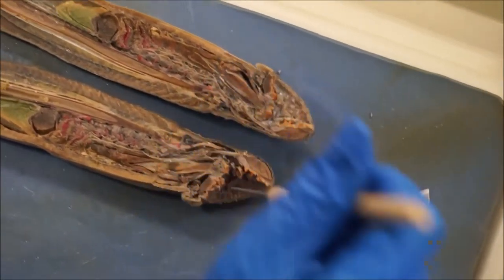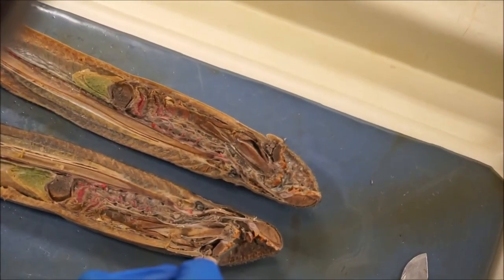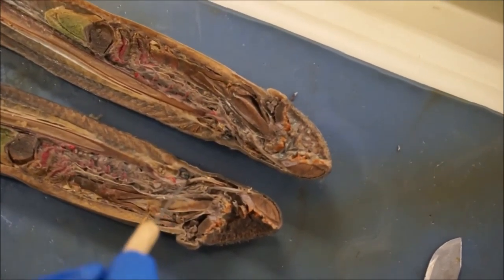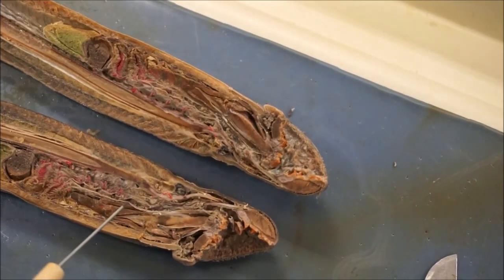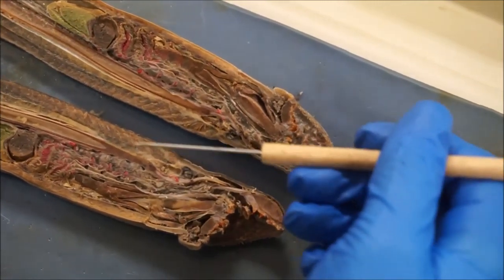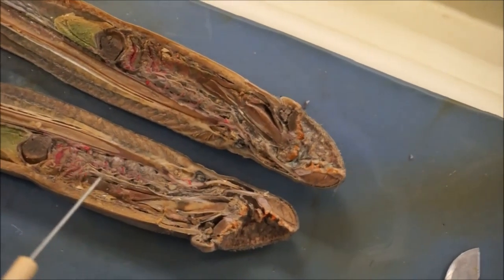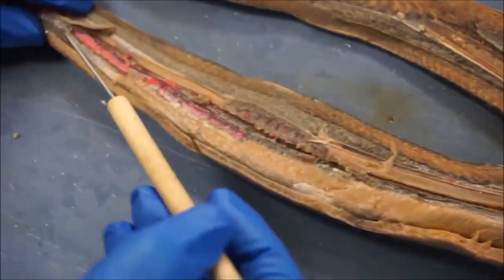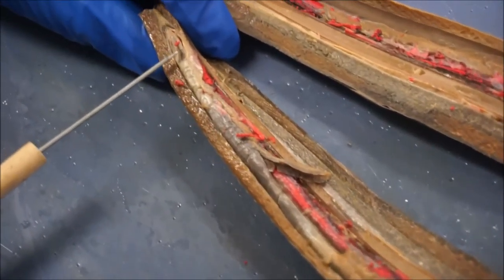In the lamprey digestive system, it starts obviously in the mouth where they begin to feed on whatever prey they choose. The blood or whatever tissues are ingested start right here in the pharynx, which in the lamprey actually divides into two different sections. One is the esophagus and the other is a respiratory tube for breathing. This division of the pharynx into two structures is specific to the lamprey. Once food gets through the esophagus, it goes straight into the intestine, which on this section of the lamprey is harder to see, but down here you can see it — this little structure that I'm moving, that's going to be the intestine.